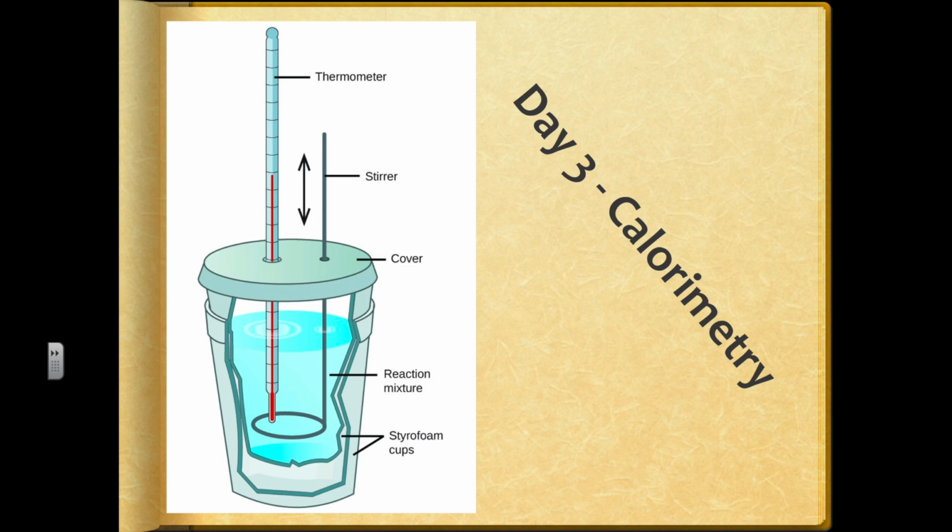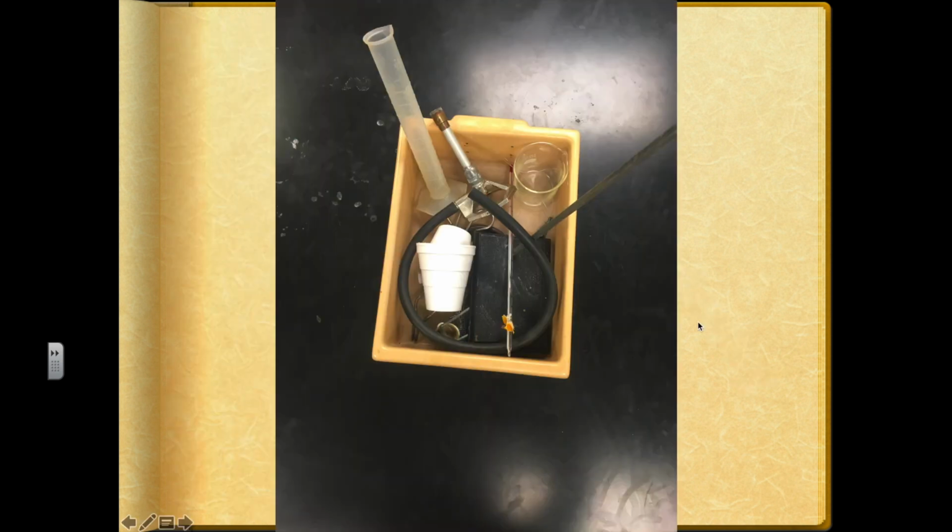Today we want to take our specific heat calculations one step farther into something useful, by using a process called calorimetry. You probably already watched the video I suggested about the theory of this, but this is how I did it in my lab. I have pictures left over from our lab last year.